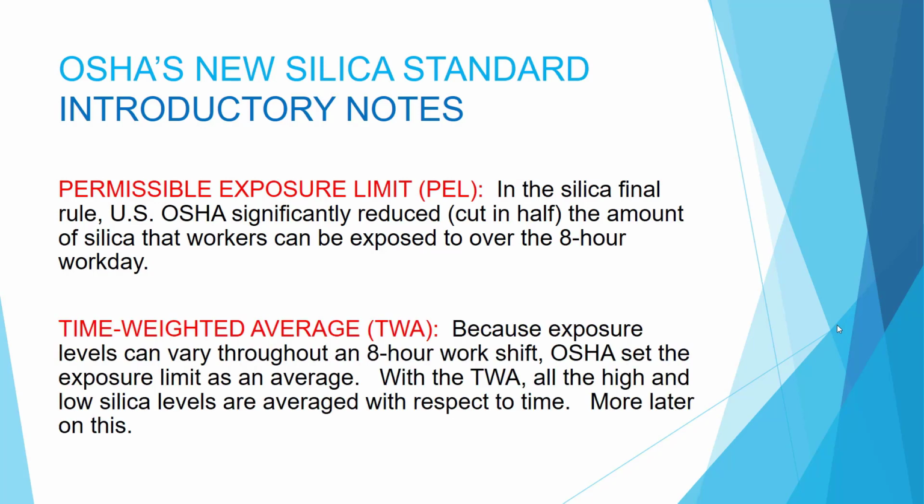Next, let's get introduced to a very important concept in air sampling: the time-weighted average, or TWA. Because exposure levels can vary throughout an 8-hour work shift, OSHA sets exposure limits as an average. With the TWA, all of the high and low silica levels are averaged with respect to time. We will cover this in more detail later.